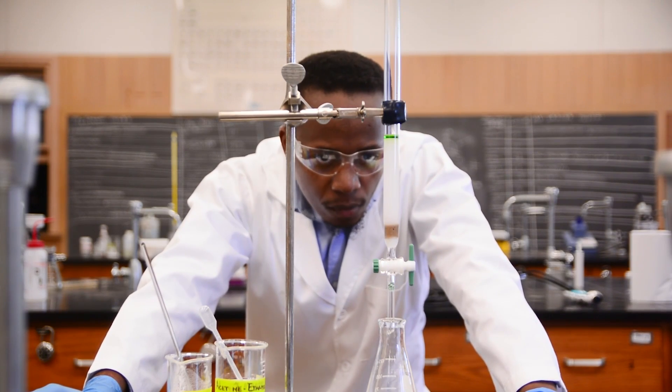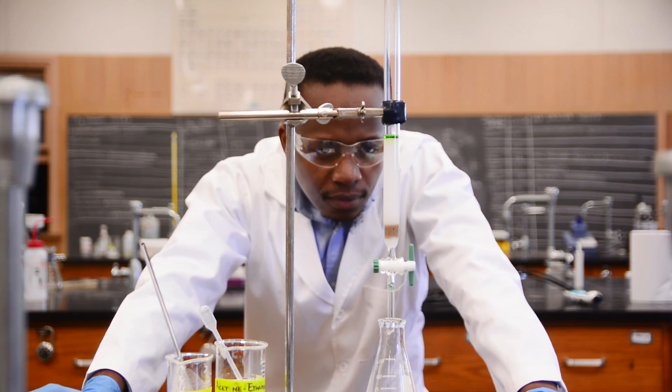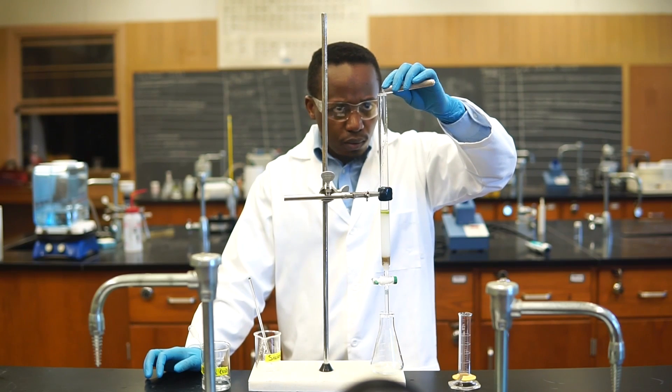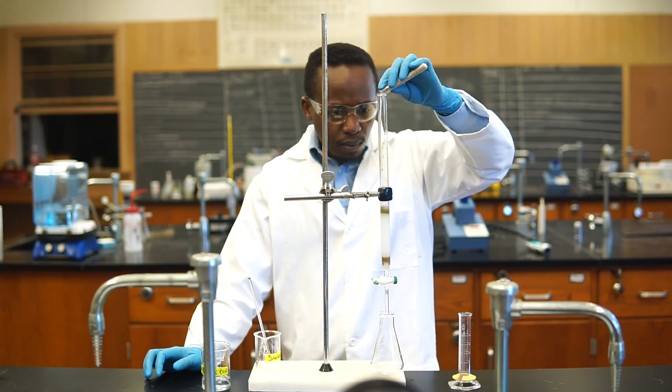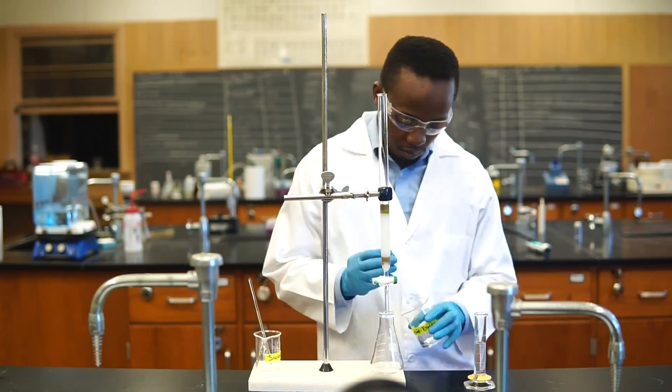After loading the sample and verifying that all of it has been adsorbed onto the column, we can add another layer of sand as a protective layer. Let's add about a centimeter. We can now fill up the column with our eluent.